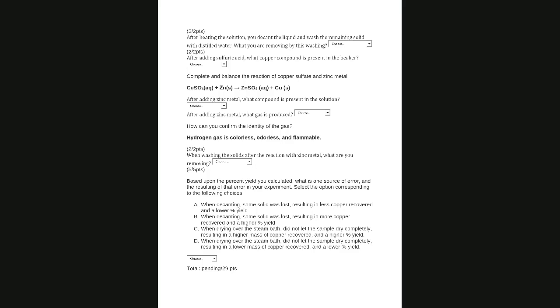All we have to do is look at the reaction, right? When we add sulfuric acid, we add it to the black copper oxide. Let's look at the reactions here. Okay, so what is the reaction of sulfuric acid?